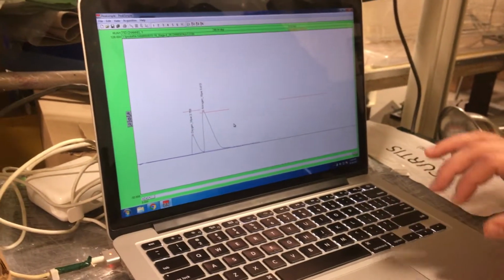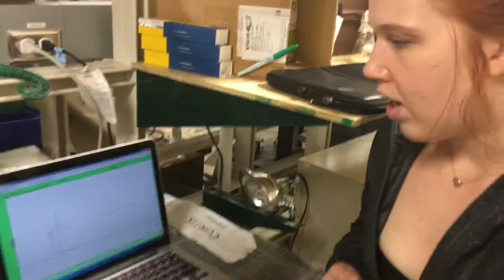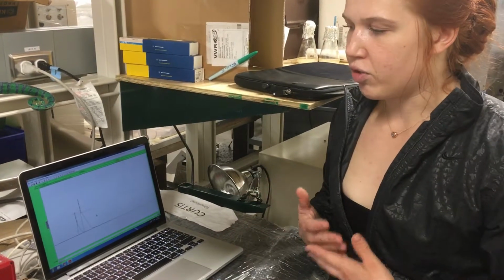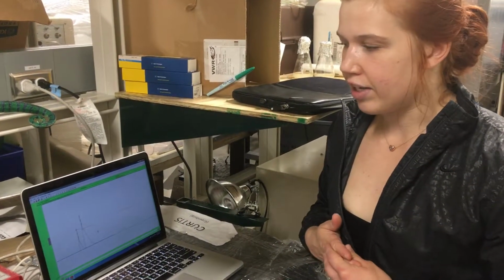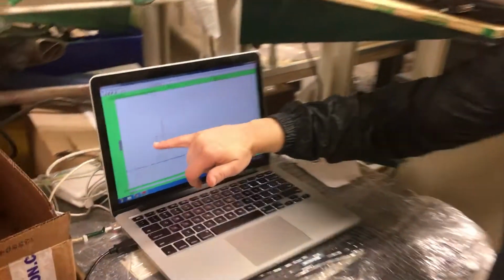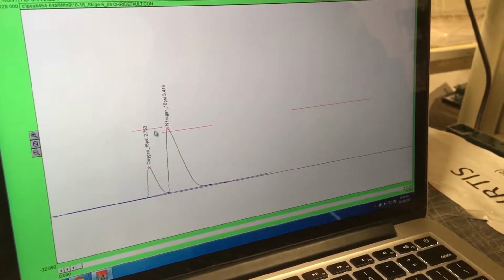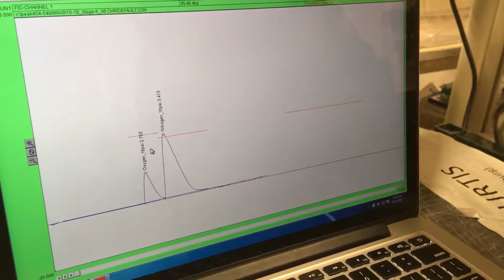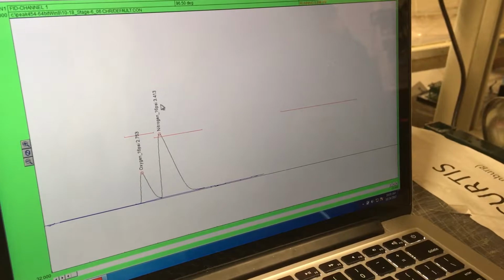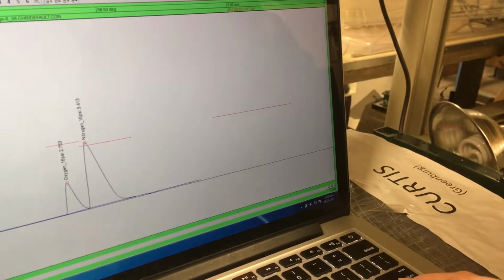Right now Declan had just put an excess of air into the sample loop, so we're going to be looking for about 78% nitrogen, about 20% oxygen, and very, very little CO2, so it should be negligible. You see here these red lines, this peak right here, this is the oxygen peak. We calibrated that and named it oxygen 16 psi, whereas here we have nitrogen 16 psi, and then this is going to be called CO2 16 psi when it's finished running this full 13 minutes, which you can see in this corner here. When it's finished running, you'll see the whole spectrum.